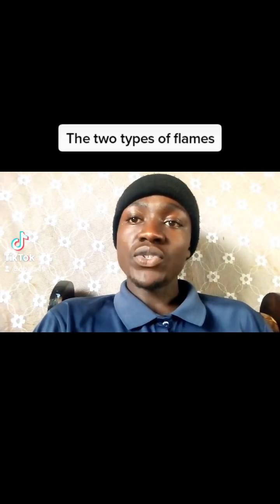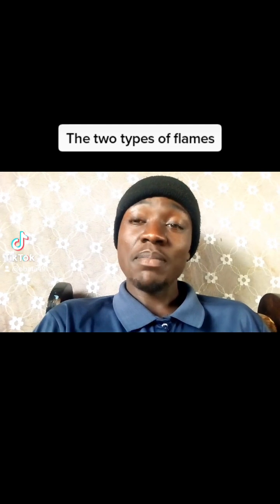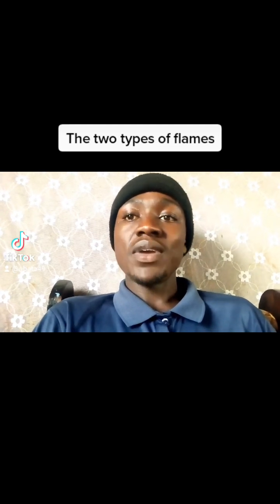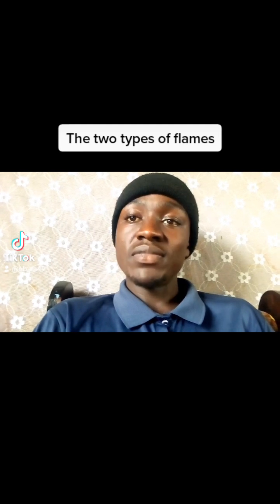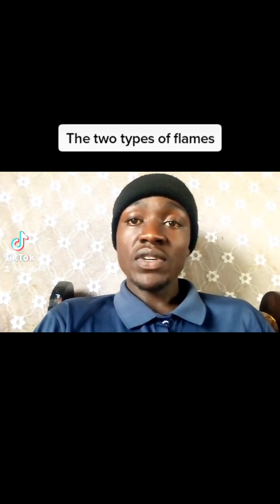The major focus is on the Bunsen burner, and when you talk about the Bunsen burner, we've got the parts. We have the parts, that is the base, the chimney, the jet, the air hole, and the rubber tube. You should be able to know the various functions of those parts.